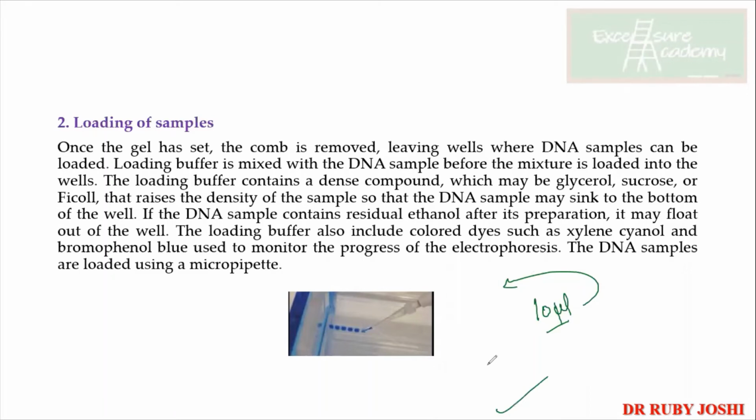And yes, again, see, for example, here also, you have to be very cautious. ऐसा नहीं कि directly load हो जाता है. So here you have to make sure that you are able to load properly. कुछ लोग क्या करते हैं, अगर well ऐसा है तो directly ऐसे load करते हैं. Like here you can see this person is loading ऐसे slightly, but then you know that in the water, when you put something like this, because of the difference in the refractive index of air and water, ये ऐसा दिखेगा टूटा हुआ. Okay, so because of which people are not able to focus properly कि मैं well में properly load कर रहे हैं या नहीं कर रहे हैं.